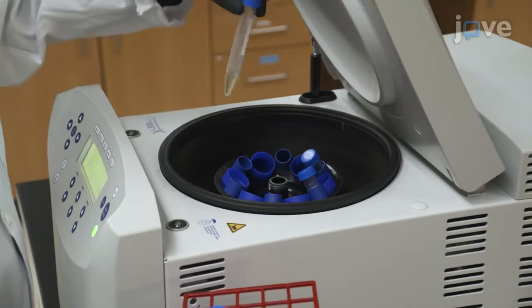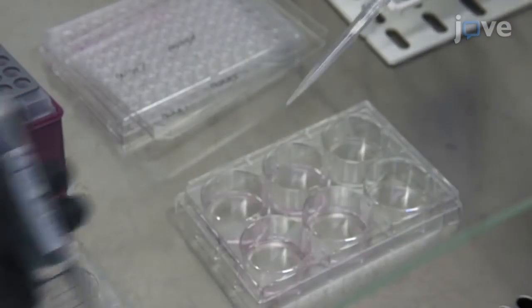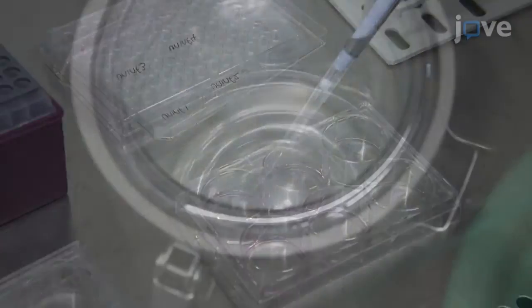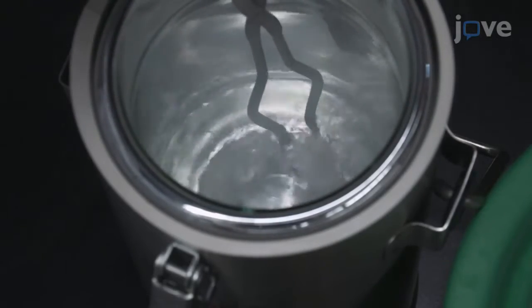The macrophage response to pathogens and detecting enough fungal proteins are important. Therefore, testing and optimizing MOIs and time points for each species are recommended. As macrophage and fungal cell culture can be challenging, knowing what to expect after co-culture is important. Visualization provides the researcher with confidence in implementing the procedure.